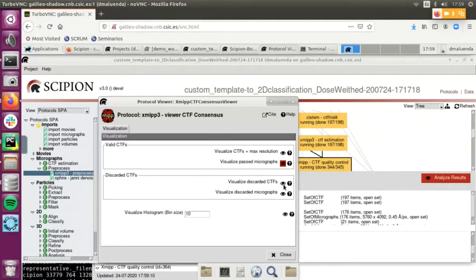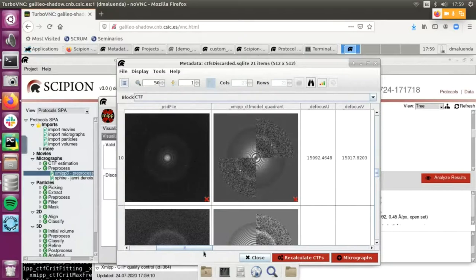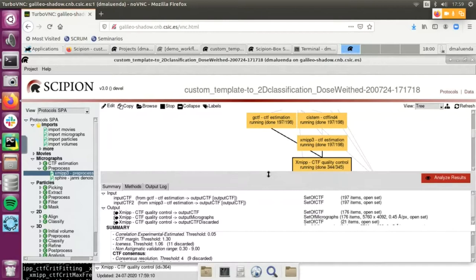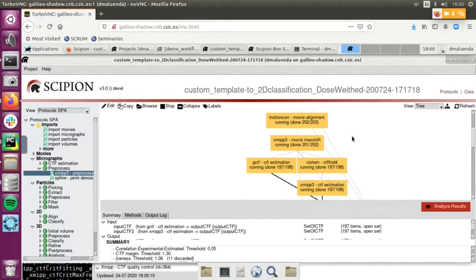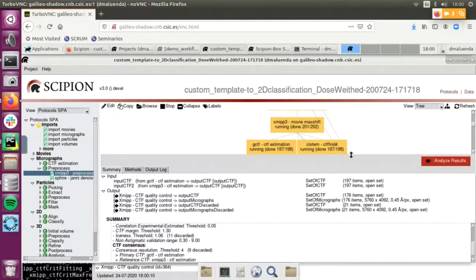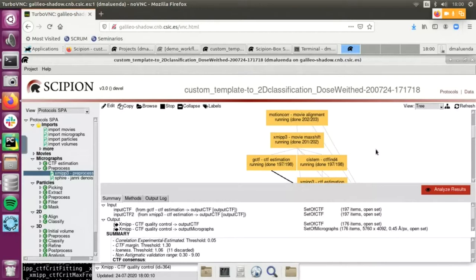And for instance, here, well, it seems good, but maybe it's because of astigmatism. We have one story. When we were installing Scipion in one facility and checking that everything was working well, we realized that a lot of micrographs had astigmatism. In that moment, the facility manager realized that they had an astigmatism problem. So it is a very important quality check.